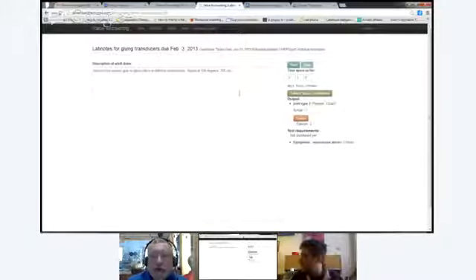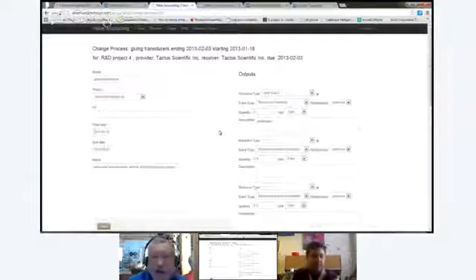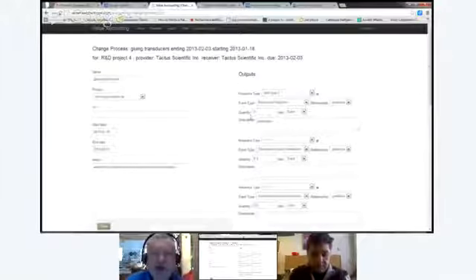Oh yes. Okay. So for now, I will require at least one output, and then we'll see how that goes. Okay, but you can have many outputs from an R&D process. Yes. This is not so at this moment for manufacturing processes, but it is for R&D. Eventually, we will make it so you can have many outputs from a manufacturing process too.